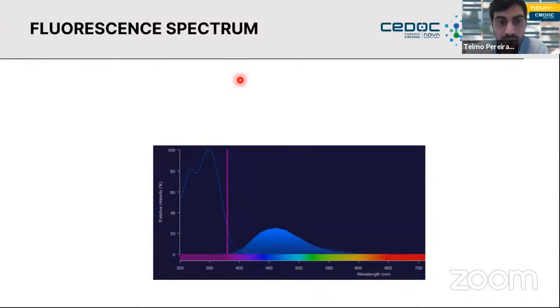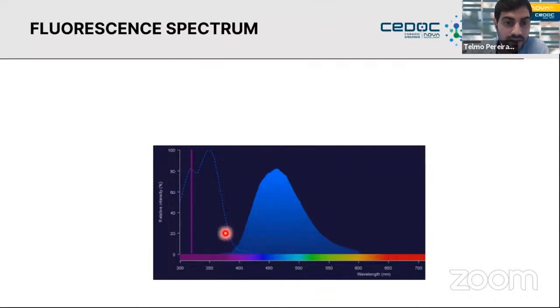So if you illuminate it with this light here, this wavelength, it will show you the profile of colors that will emit from your sample. It will contain a peak, so it will be brighter around this blue part of the spectra, but you will also get smaller parts of green and a bit of this violet light. Okay, so if we now change the excitation light to a different zone, you can see that the spectrum remains the same shape, but now it has a different height.